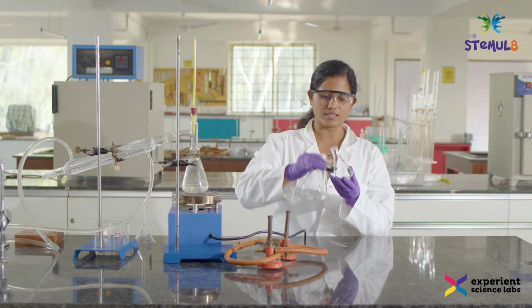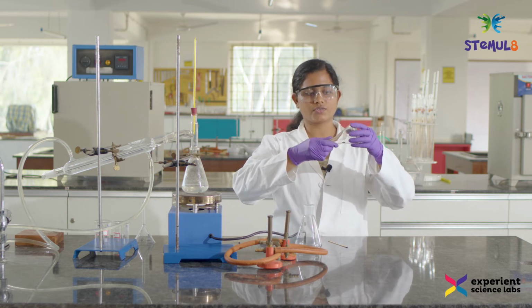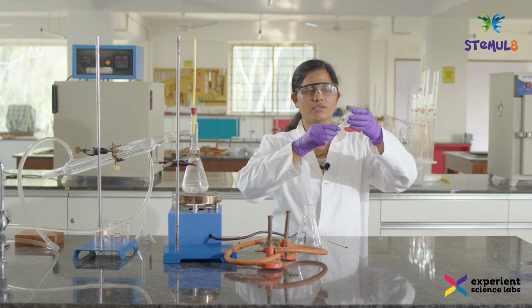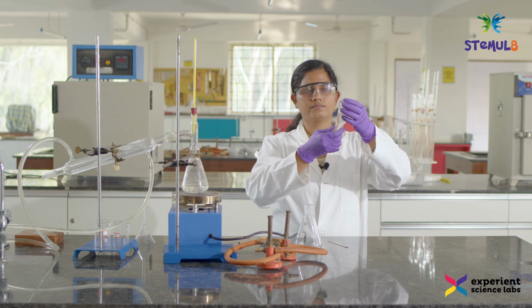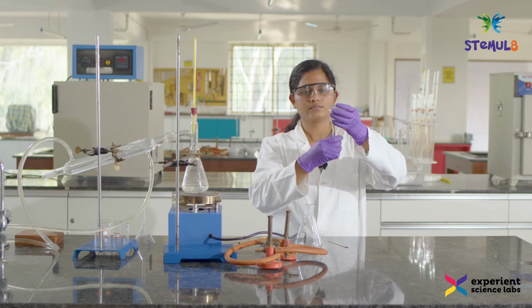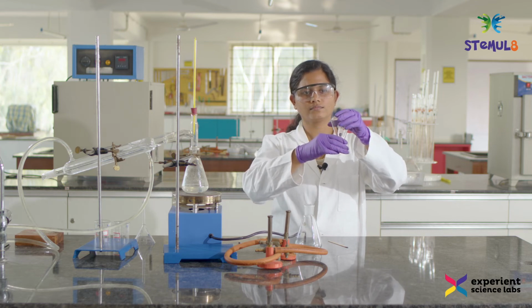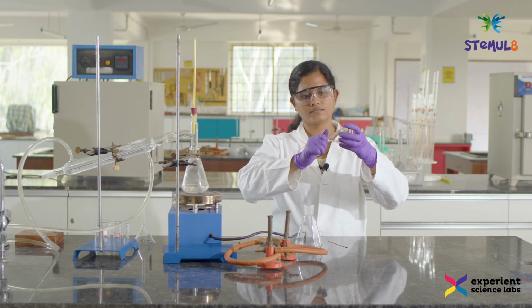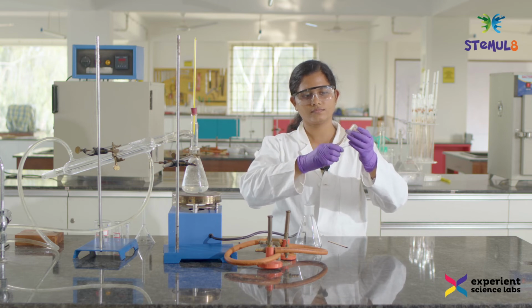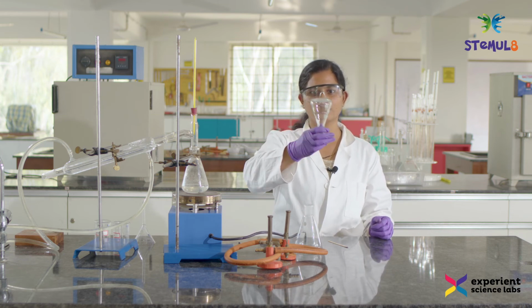Transfer a little bit, and then just rotate your conical flask so that your ethanol gets dried up. So now you see the conical flask is dry.